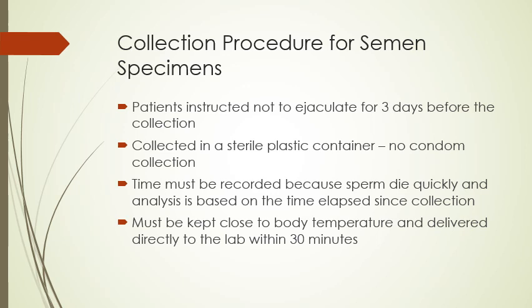And they have to be kept as close to body temperature, delivered directly to the lab within 30 minutes, or the sperm could die that quick.